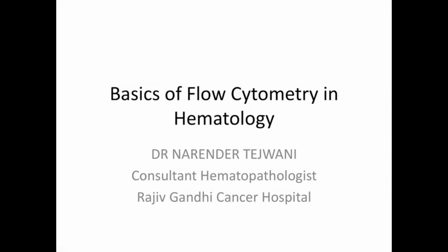In the current chapter, we are going to understand the basics of flow cytometry, particularly those concerning its application in the field of hematology. The first question which comes to our mind is what exactly flow cytometry is, and the answer to this question lies within the name itself.